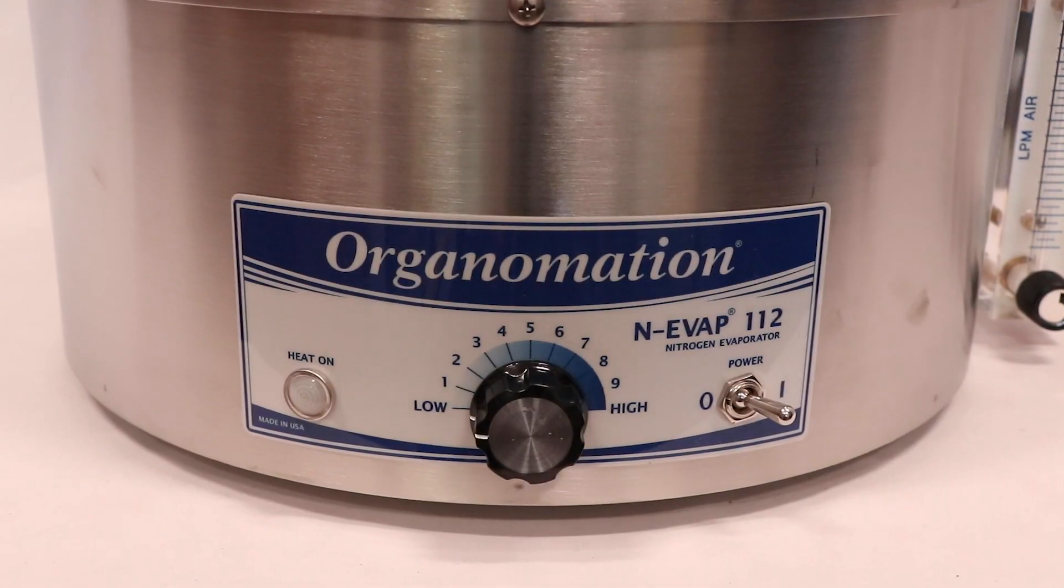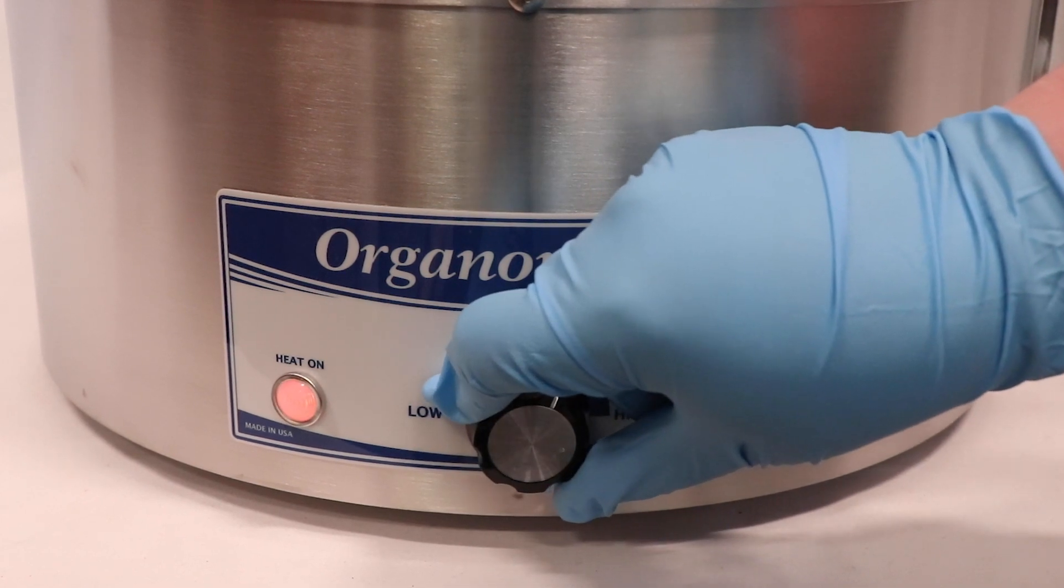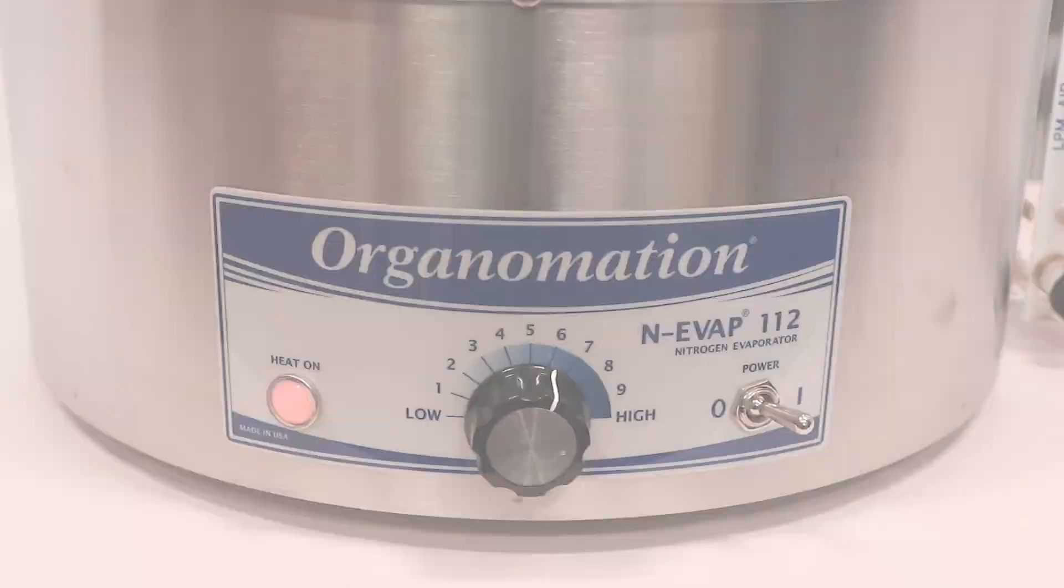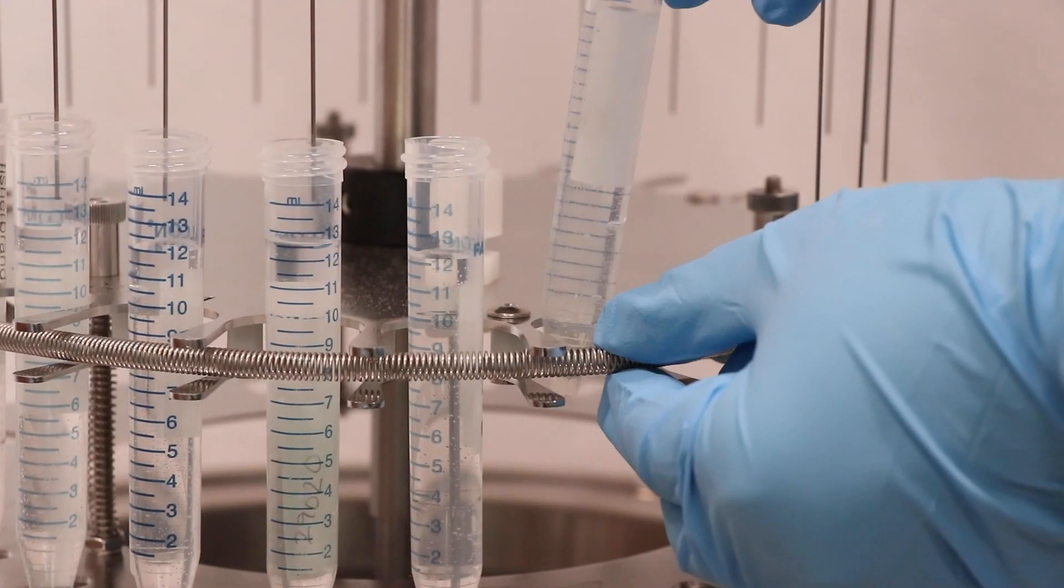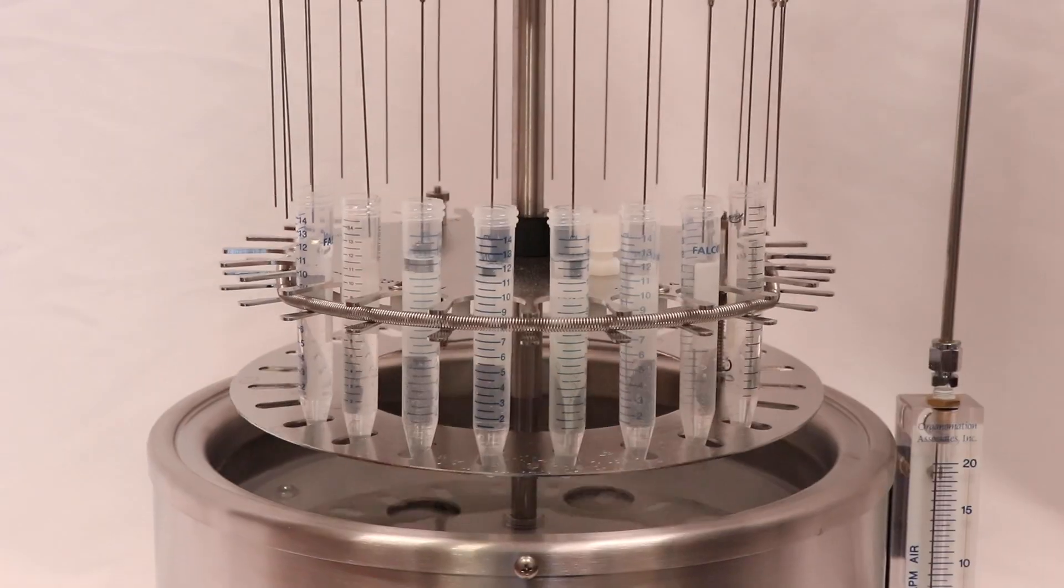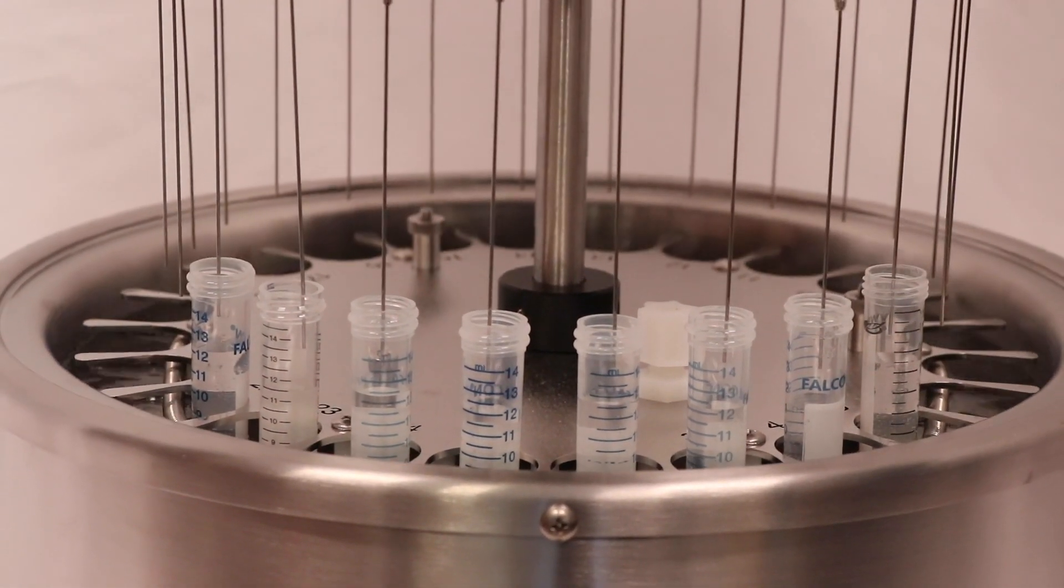Although nitrogen blowdown evaporation can be performed by hand, laboratories will often use a nitrogen evaporator to make the process more efficient. A lab technician will begin by placing their test samples into a nitrogen evaporator. They will then be lowered into a heated water bath which is set to a few degrees lower than the boiling point of the solvent you're working with.